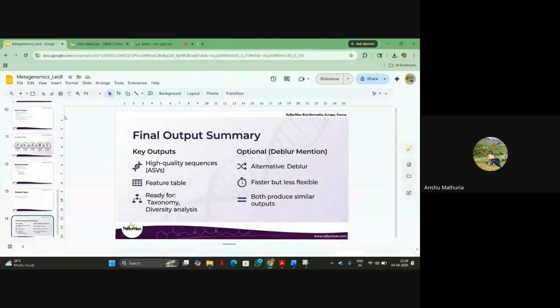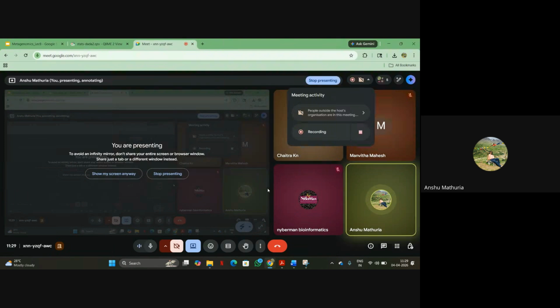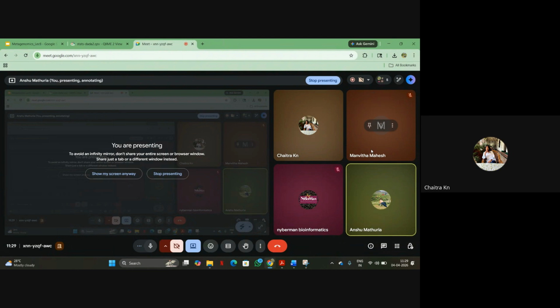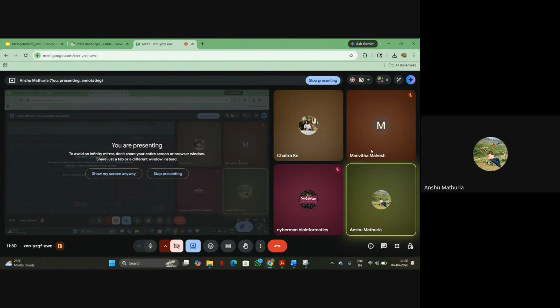Ma'am, can we run the second command? Oh, did the command run? Can you just share your screen and show me what files got generated? Sure, ma'am. Manvita, is it done for you as well? No, ma'am. It's still running.